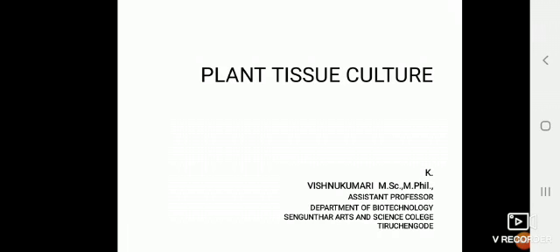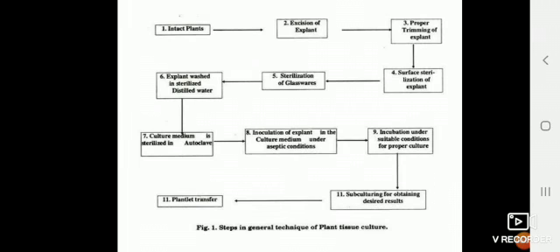Plant tissue culture. First, we are going to see the process involved in plant tissue culture processing.